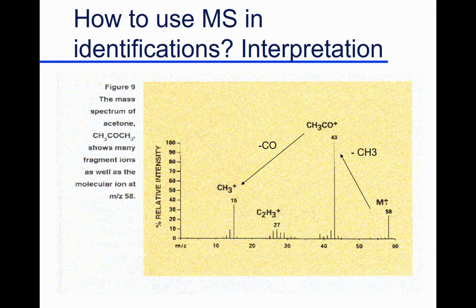And of course, in your research, oftentimes you'll put C13 into a sugar molecule, for example, all C13s. Then you react it with something, look at the product and say, where's the C13? How many? Oh, they came from the sugar. So you start determining pathways, chemical reaction pathways or metabolic pathways in plants, by looking at the isotope abundance. Yeah, that's a very useful tool.